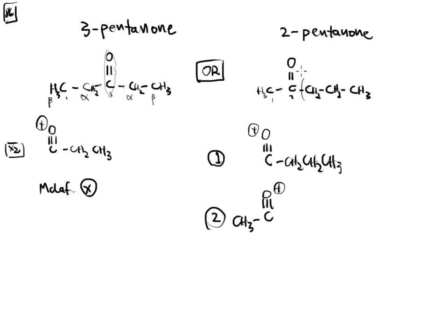All right, now let's check the strange, weird way that McLafferty could come into the picture. So again, this carbonyl bond is really part of the functional group, so I can't really count that carbon. So this is the true alpha carbon right there, and this is a beta, and this is a gamma. So yes, McLafferty rearrangement can happen. The way that this works is that this C double bond O will pull off a hydrogen from that particular carbon.